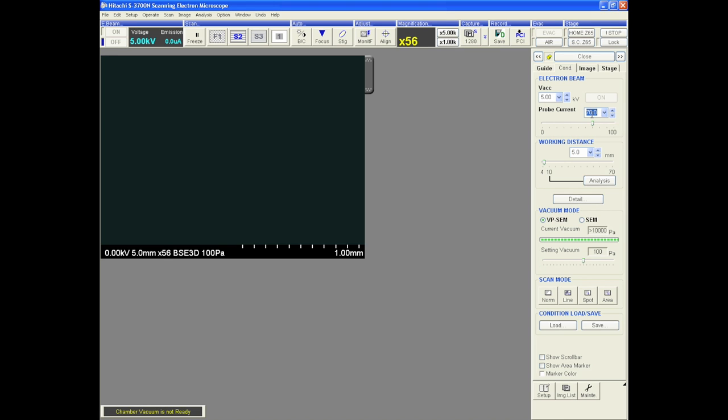Probe current dictates the amount of electrons sending information to the detectors. High probe current is good to begin, but low probe current is good for high magnification.